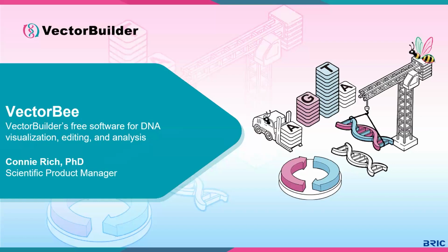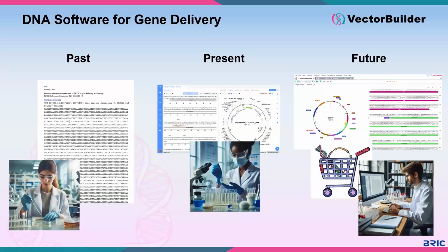Now, when we're talking about DNA software, there is a wide range of experiments and applications that this is really important for, but it's a very crucial tool in gene delivery.